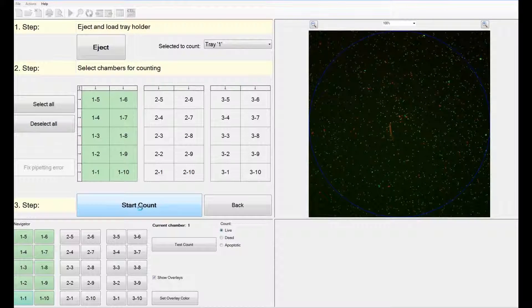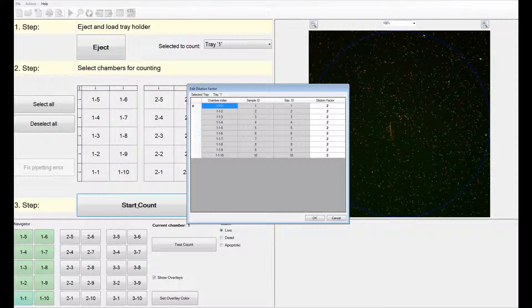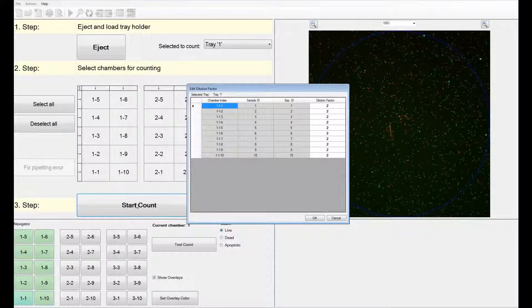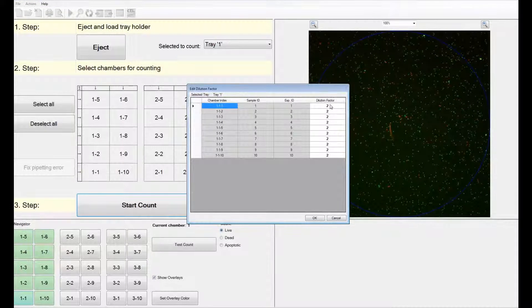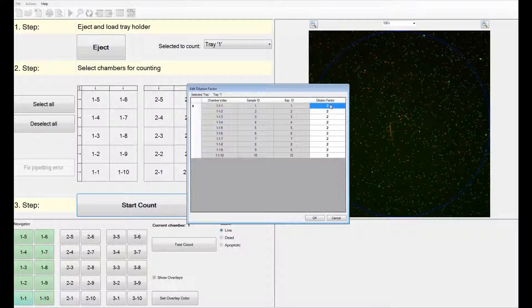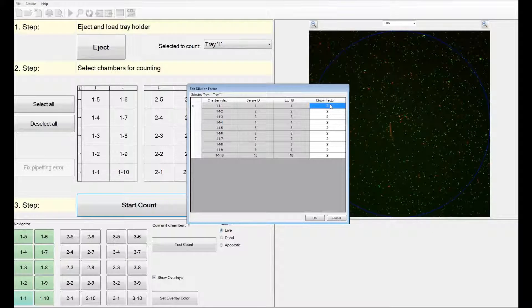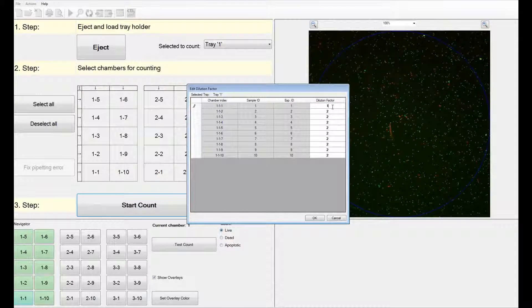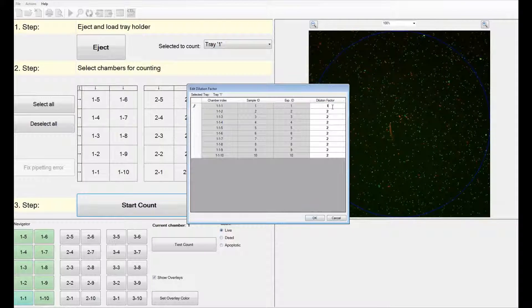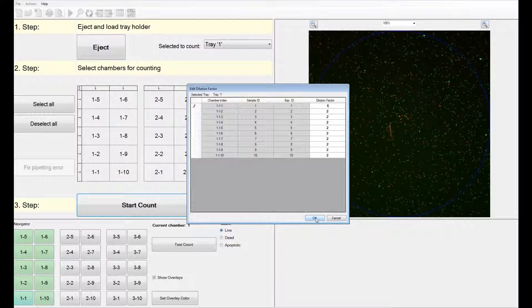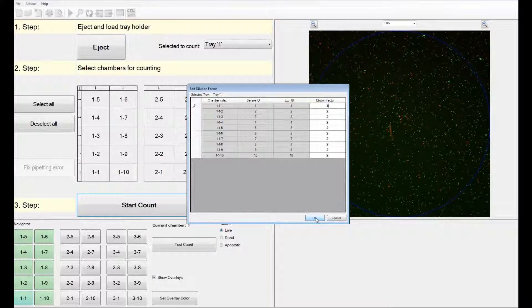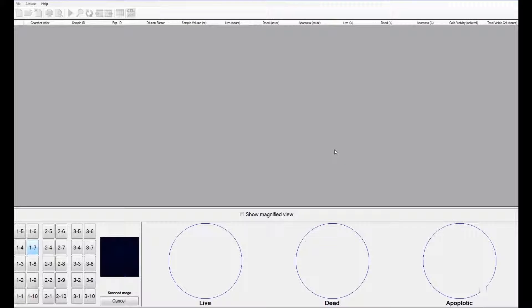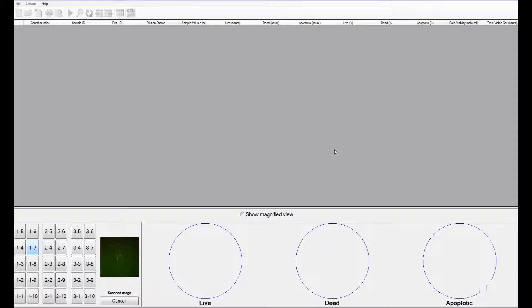At this point, you can say start count and get started. If you would like to make a change to the dilution factor, you can do so at this time. Once you have made sure that everything you entered was correct, you can say OK and let the software do the rest of the work for you.